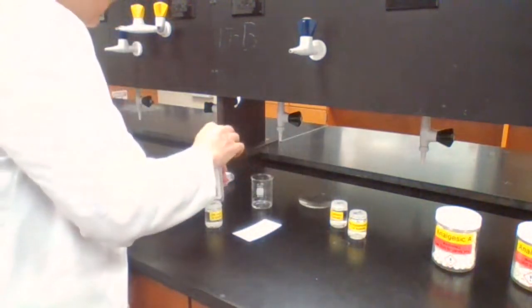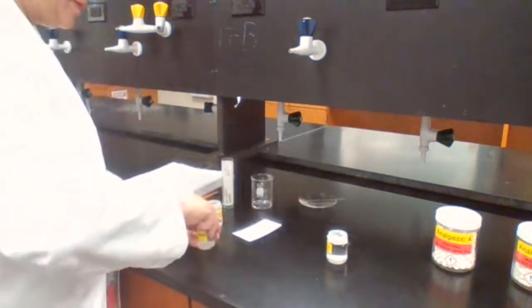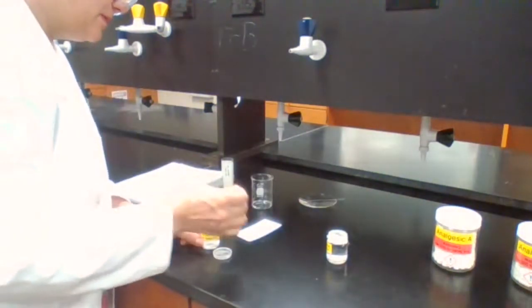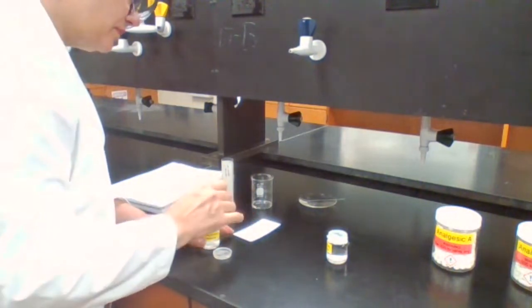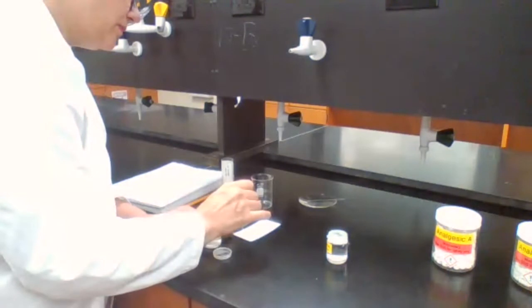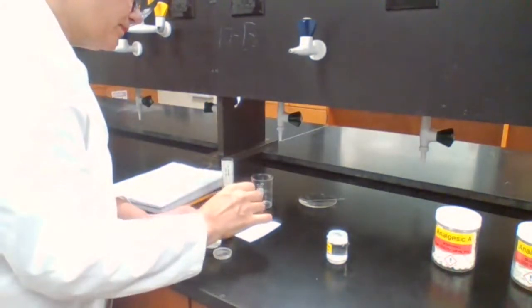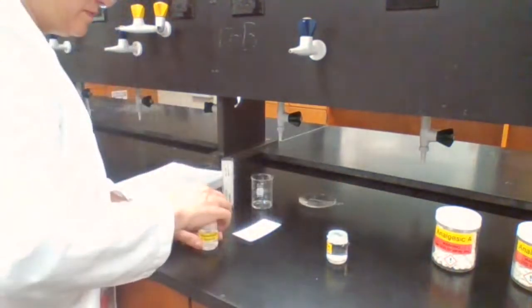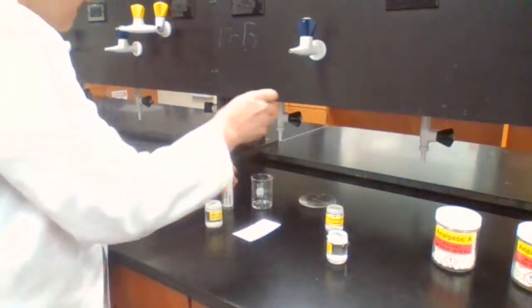A new capillary tube for 2 is going to be acetaminophen, so I put a spot for 2. Three is caffeine.